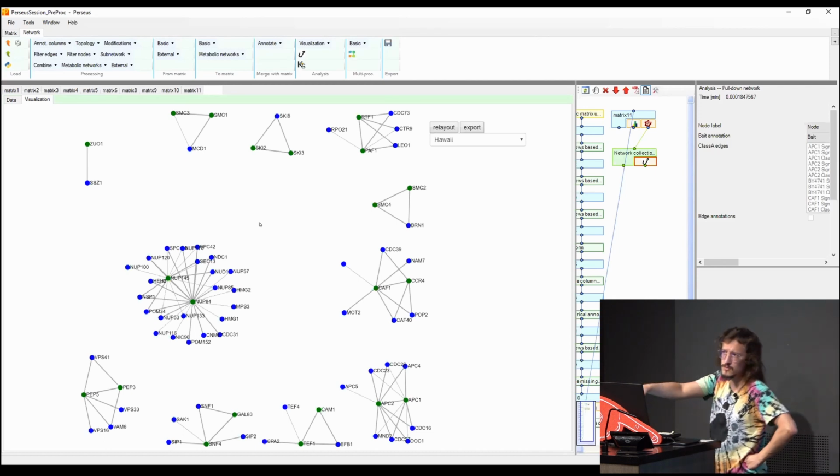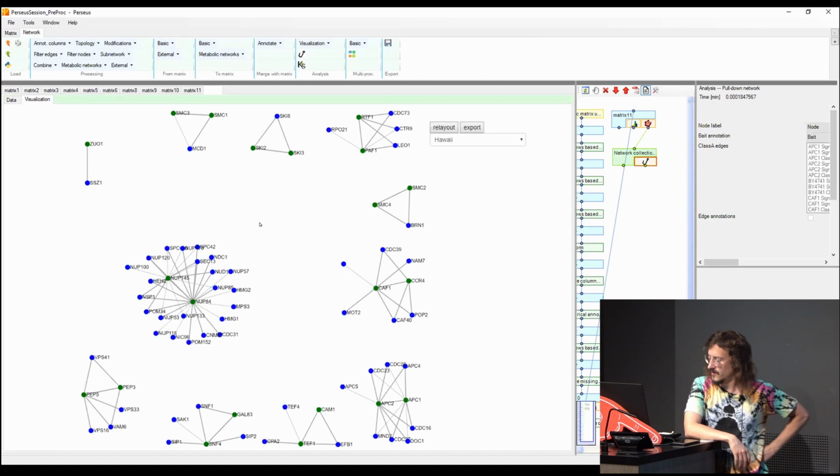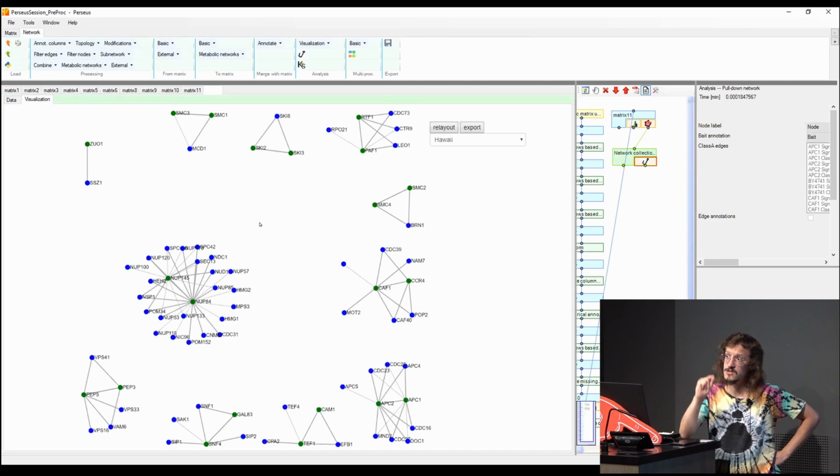Yes, you can also do it from the network, but you have to specifically select the node and the edge that you want to remove. Remember that when you do networks, there are 2 matrices. One is node, one is edges. You have to take care of both of them. When you remove a node, you then also have to go into edges and remove all the edges that relate to that node. Otherwise, you will get an error.